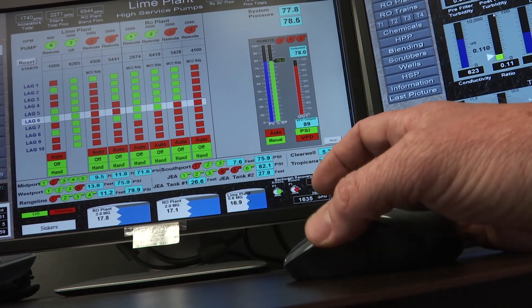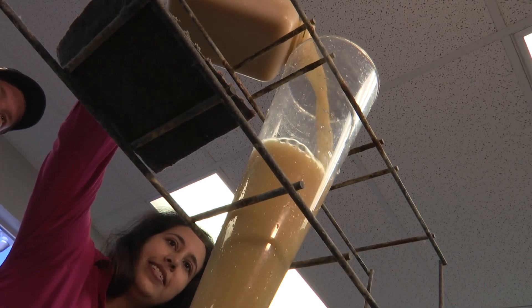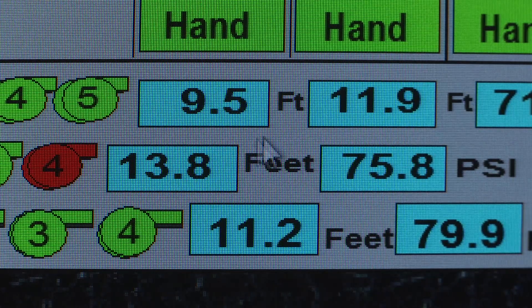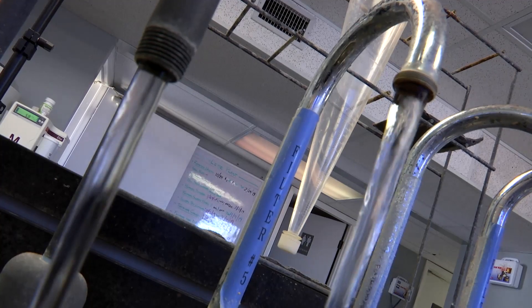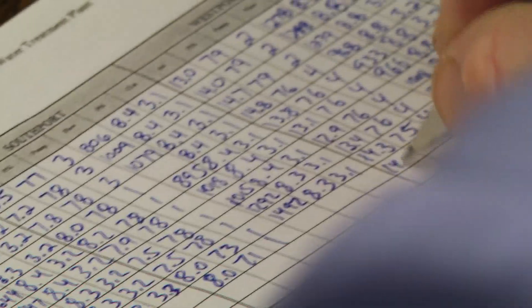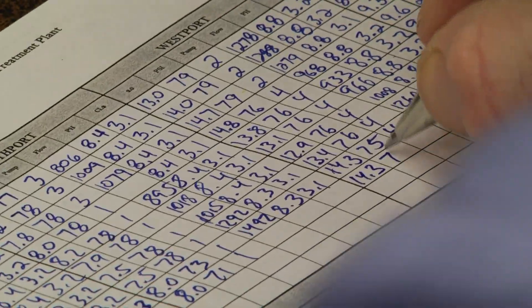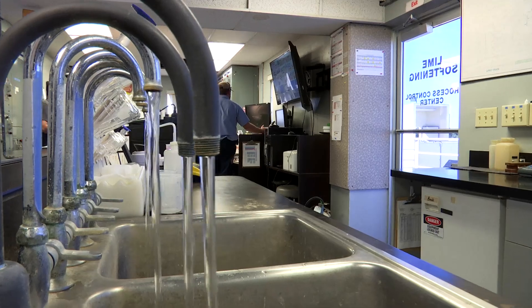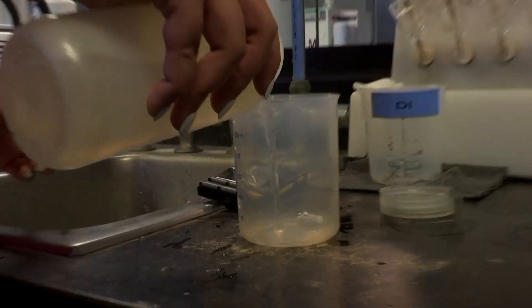We check pH, we check turbidity — that's basically checking the amount of particles that are in the water. We're also going to check chlorine of the water. We're going to go ahead and write down our tank levels from the computer, and we're going to grab samples from the accelerator. Once we grab those samples, we'll come back inside and check all of our parameters in the lab here. We have strict guidelines that we have to follow to be in check with DEP standards and also for the Department of Health.